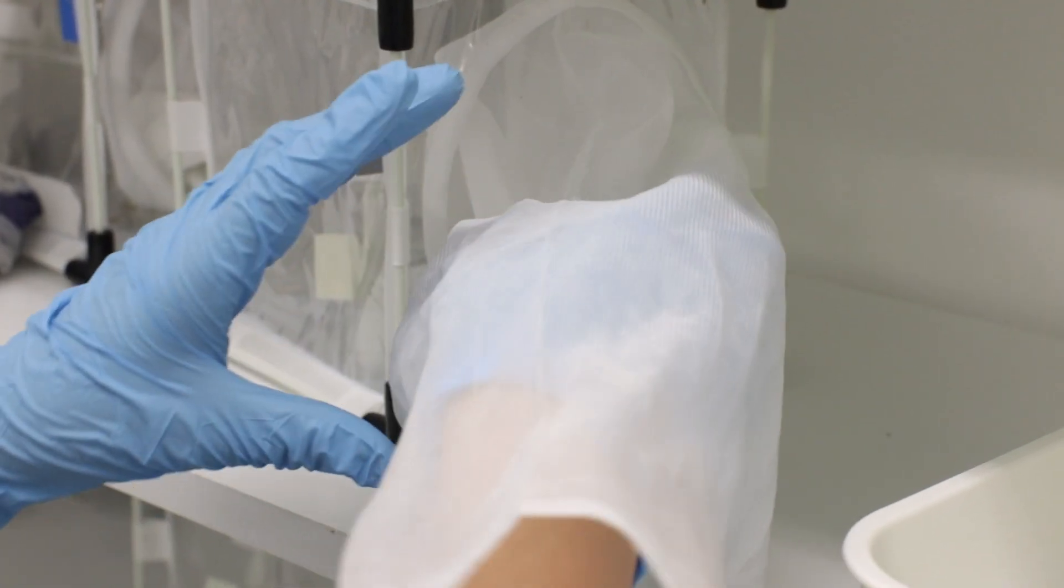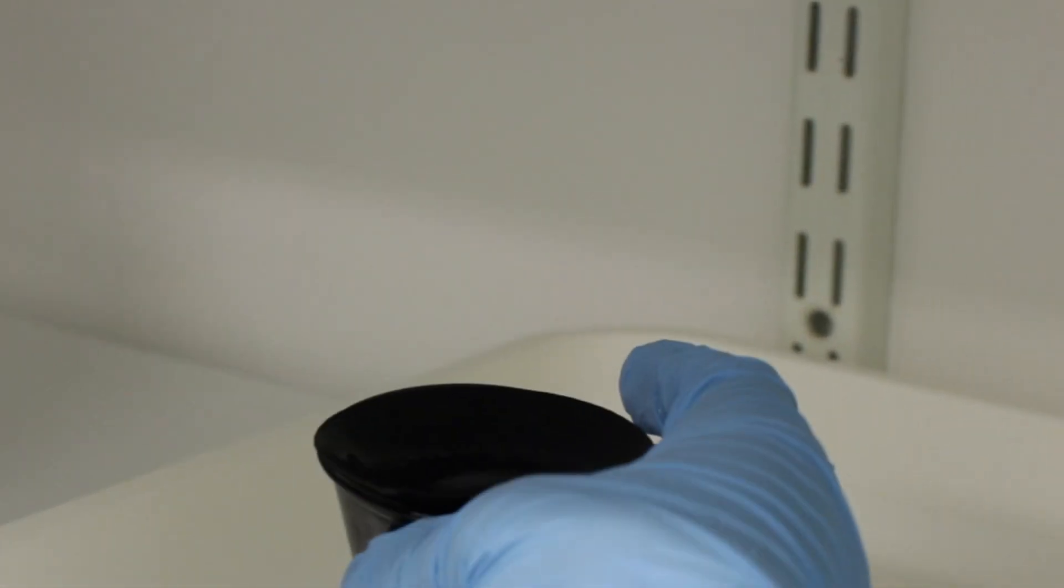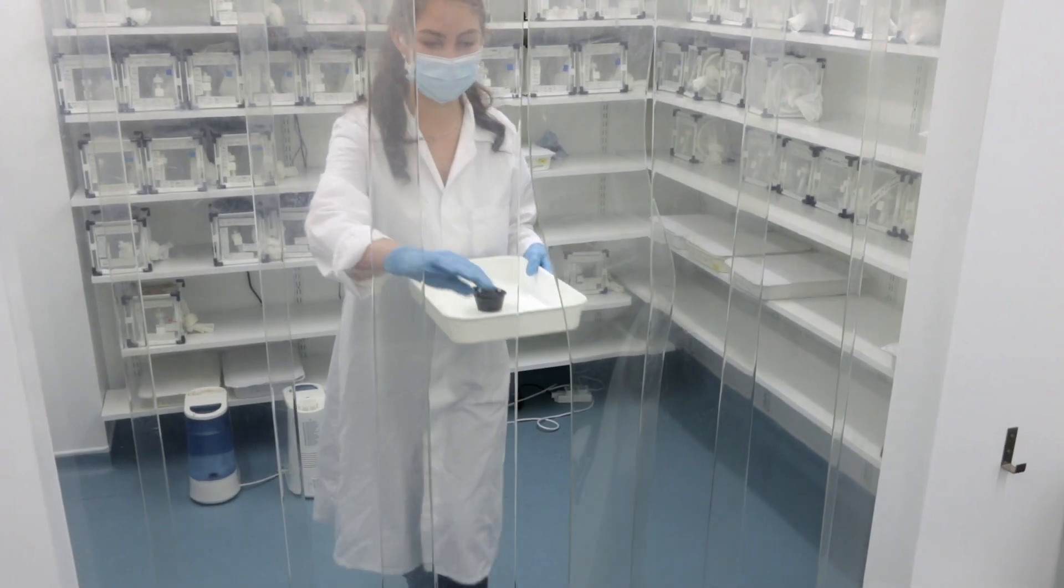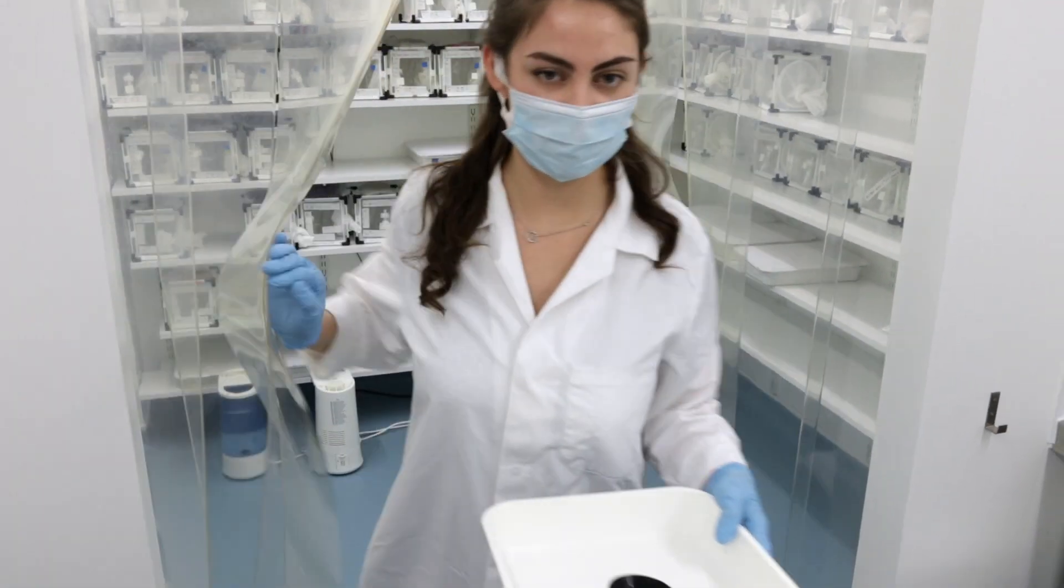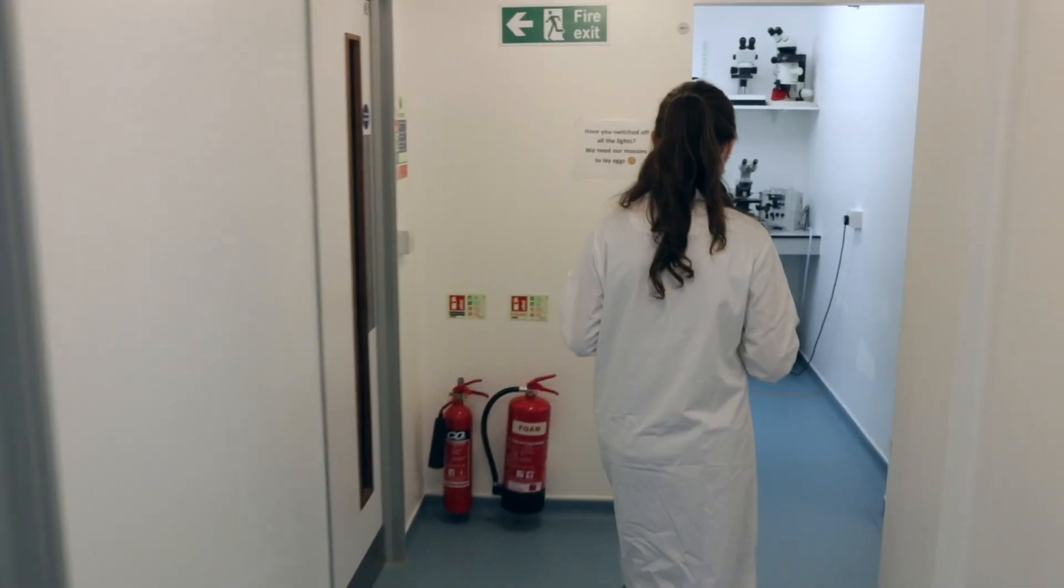What you can see here is a cage of wild-type Anopheles, a type of mosquito that can spread malaria. We are developing new mosquitoes to fight malaria-transmitting mosquitoes like these. We feed them so that they will lay their eggs, which we then use to make the self-limiting strains that we use at Oxitec.